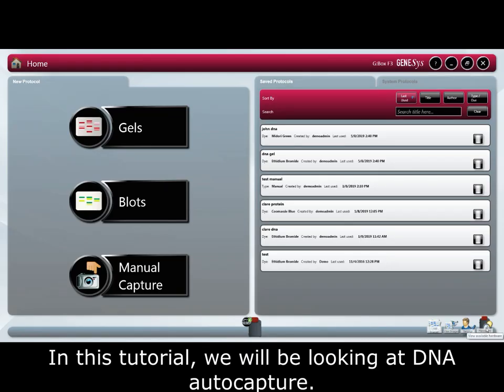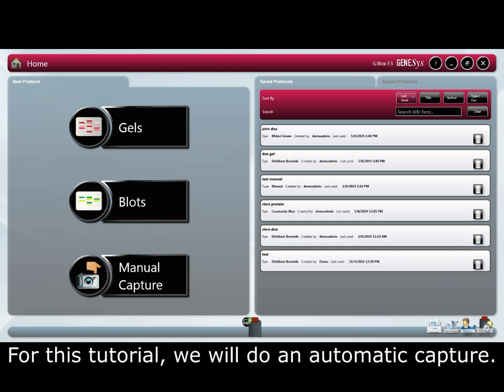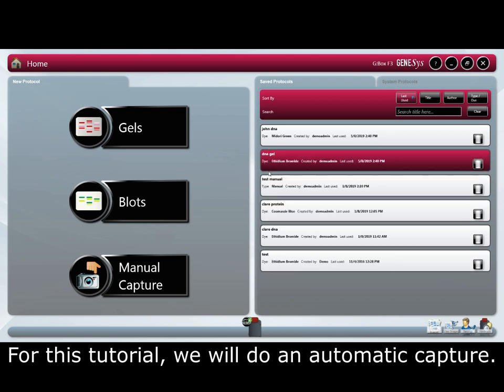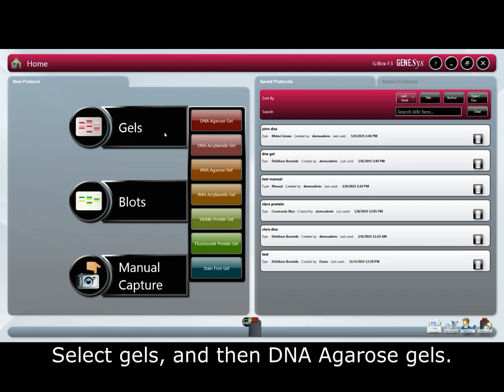In this tutorial we will be looking at DNA auto capture. In Genesis you have two imaging choices: manually or automatically. For this tutorial we will do an automatic capture. Select Gels and then DNA agarose gel.